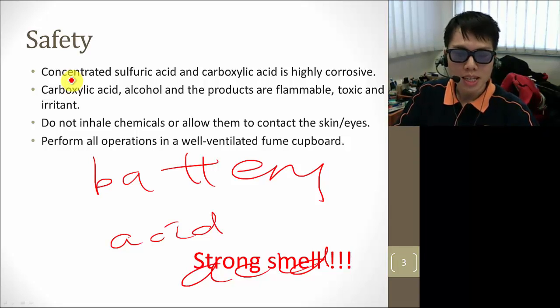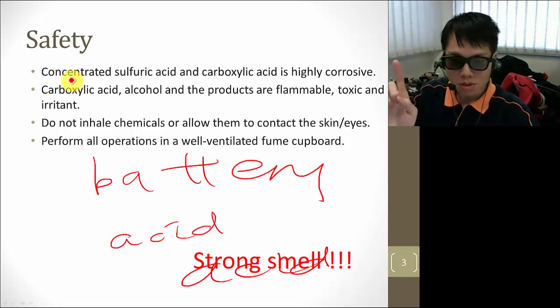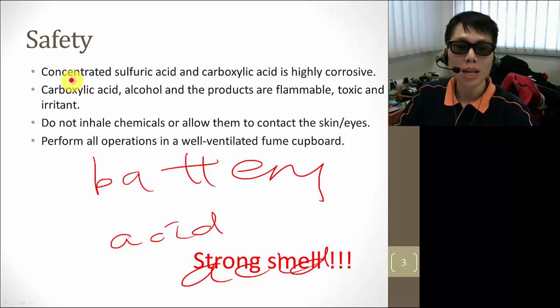So the alcohol, the carboxylic acid, and the esters produced, they are all flammable, toxic, and irritant. Any fire nearby is a no-no. You could set the whole lab ablaze, and you're going to come back maybe half a year later to complete your experiment. And certainly no drinking of that alcohol. No drinking. No tasting of the esters, no matter how good it smells to you.